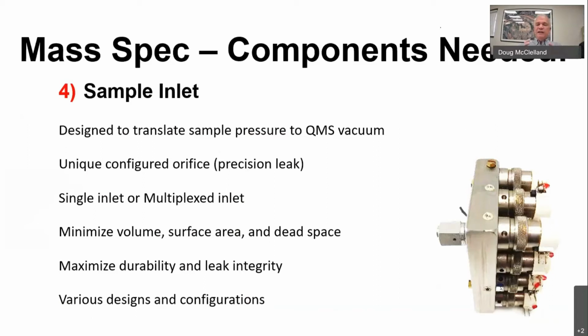And the idea of this sample inlet system is to minimize the volume, minimize surface area, minimize dead spaces. You want the components to be high durability. You want your valves to last through many, many cycles and have great performance and great leak-tight integrity.